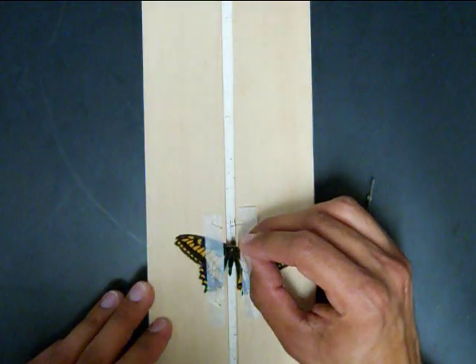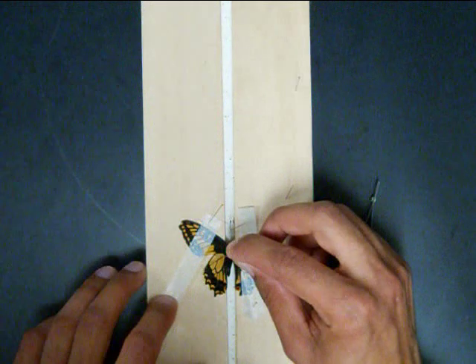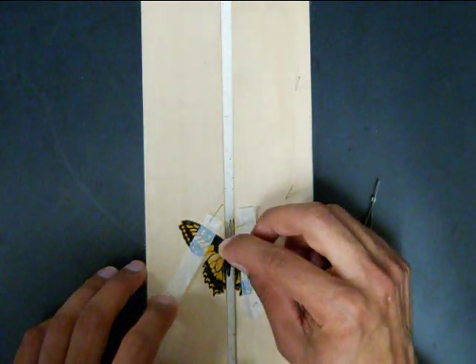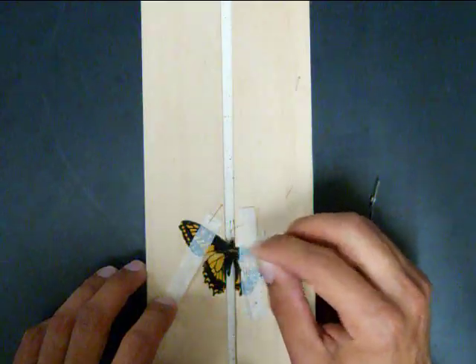With the pin lightly pressing on the base of the forewing, rotate it forward until the rear margin is perpendicular to the body. Make sure the front wing margin of the hind wing overlaps the rear margin of the forewing. This should ordinarily be performed prior to spreading the wings.